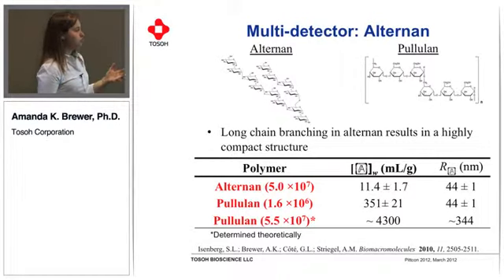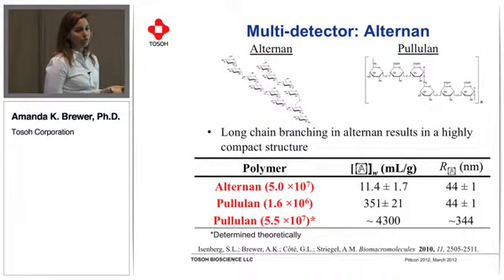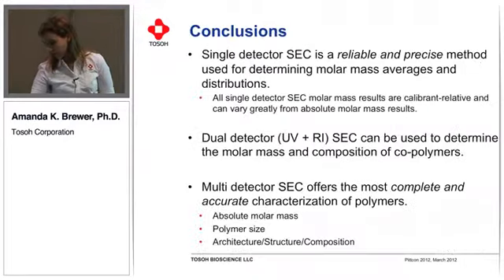So this is just to show you the information that the viscometer can tell you and how it may help you form a more complete picture of not only the structure but the branching of your polymer.